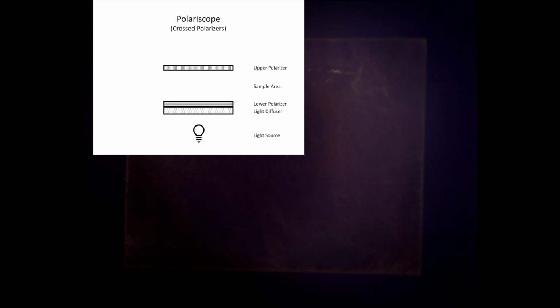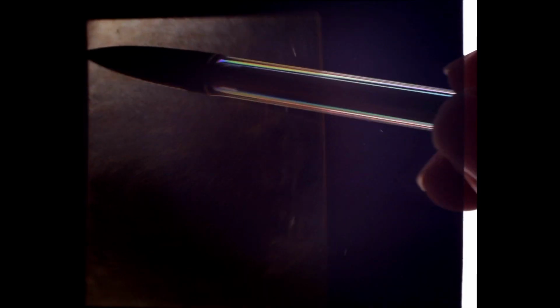Let's bring in our upper polarizer now so we can view our specimen with crossed polarizers. Now we'll begin to rotate our specimen with crossed polarizers, and I want you to notice that it mostly is just staying extinct. What this means is that we must be looking down one of the optic axes of our Phlogopite in order for it to display this behavior. And this is well within the realm of possibility given the small 2V angle of our Phlogopite and the axial relations between our crystallographic axes and the directions of our optical indicatrix.